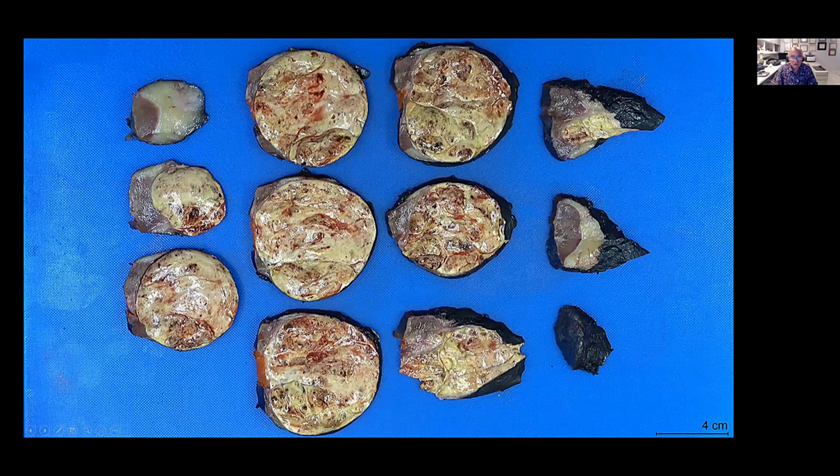Anyway, these are some pictures taken from your collection, very good pictures taken by residents. Sometimes they take only the external surface, and that is something that probably they heard about. We need to take pictures, and the external surface is good to have.